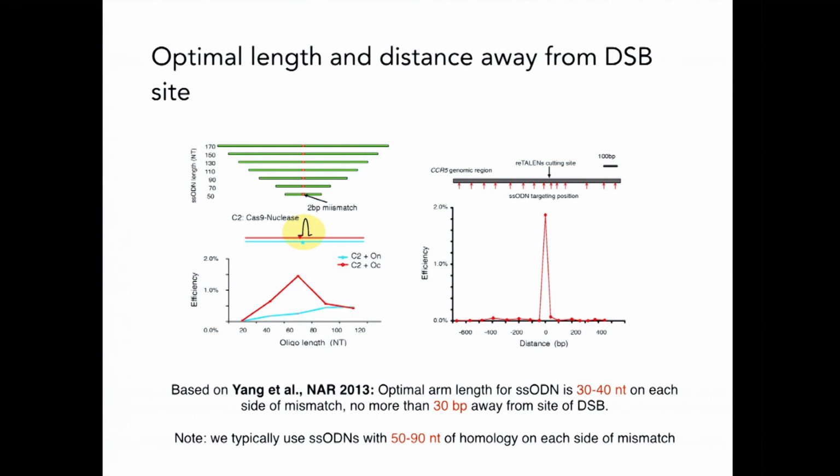Okay, so again, when you're doing HR, you use CRISPR to make the cut, and then you have your repair template. And as we've discussed previously, CRISPR or Cas9 is great, especially as pyogenes, because there are so many different sites that it can target within the genome. However, when selecting your target that you're going to cut when you're trying to do HR, you need to take a few things into consideration.